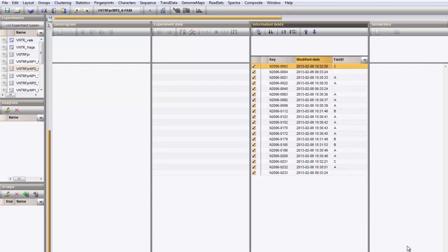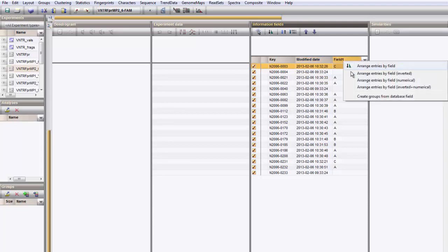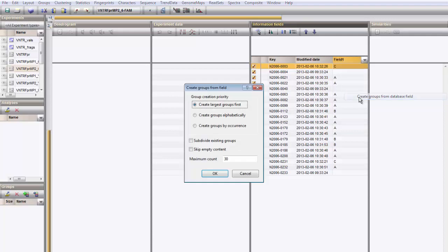You can use a database field to create colored groups. Right-click on the field heading and choose Create groups from database field.